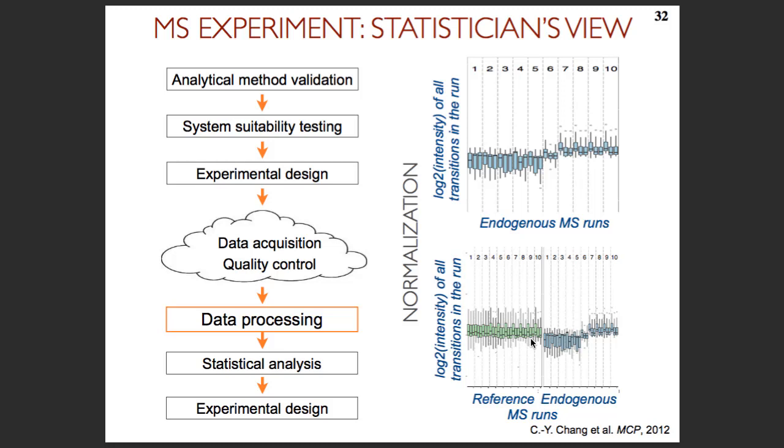For this particular kind of study, you would need to see what works best in this particular context, right? If your samples are very different, they can be different for biological reasons, but also for technological reasons. You need to find a workflow which can take it apart, because otherwise you will pick up signals which have nothing to do with your biology, and you can go after those potential candidates and targets for too long, and then it falls apart. So you want to find those artifacts as soon as possible.